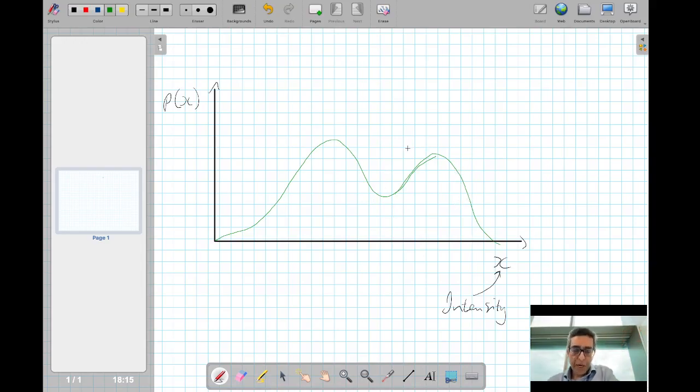You can do that with the histogram that I've shown you in the previous Python notebook. You basically need to smooth it and you need to normalize it. But let's say that we did that process, and we'll talk about how you do that a bit more later on. The question is, how do we explain these two bumps here, and therefore, in explaining these two bumps, how do we then figure out how to set the threshold optimally? That's what we're trying to do now.